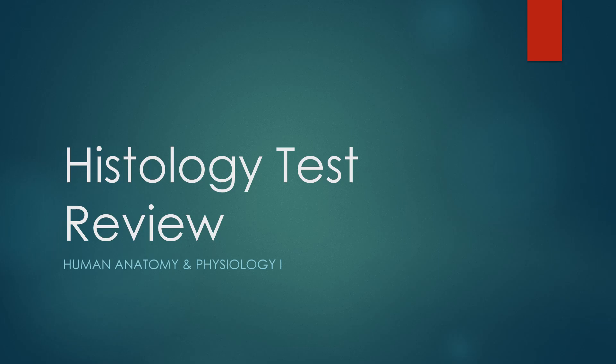Hello A&P students. I'm going to be providing you with an overview of our histology test as a reminder of what you saw and pointing out characteristics that are clues to the tissue type's identity. I know the histology test was pretty challenging for a lot of you. Going forward, think about what worked for you in terms of studying and what didn't work. The more hands-on experience you can get prior to lab practicals, the better.